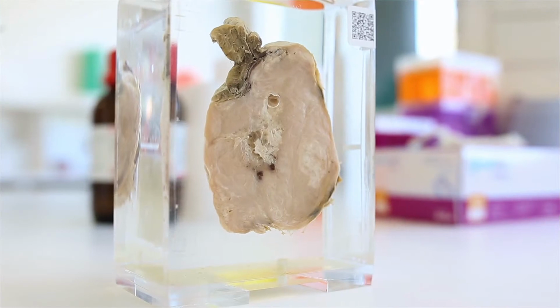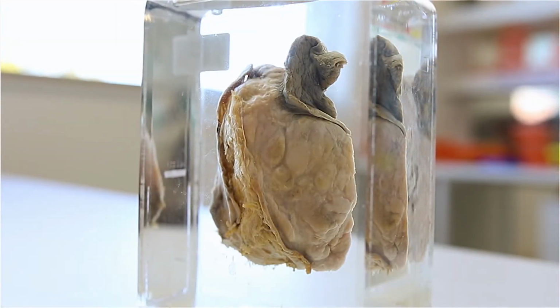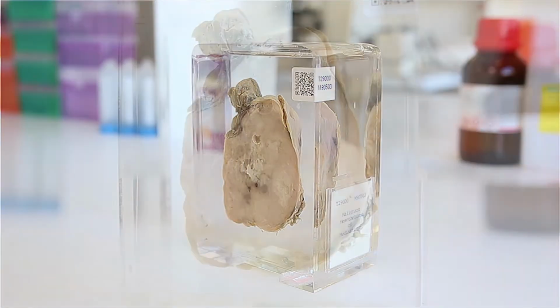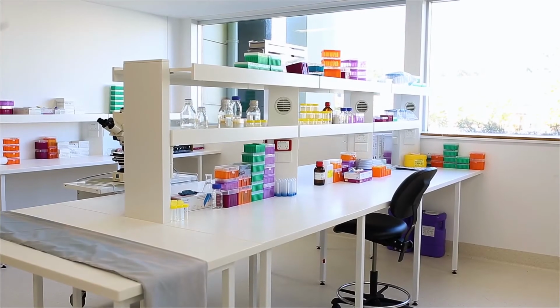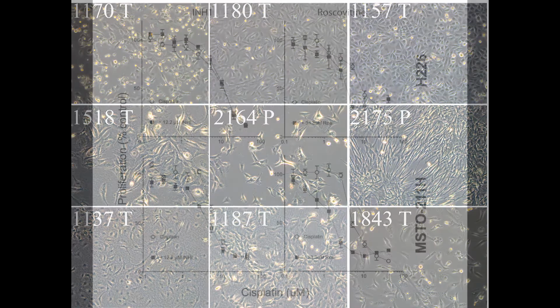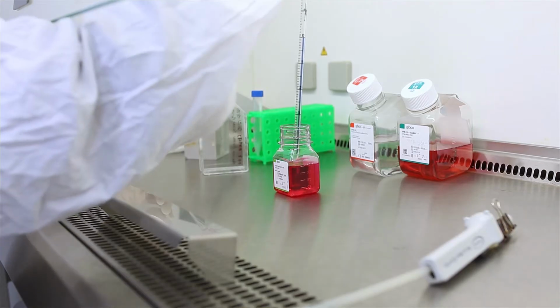Current drug-based therapies for asbestos-related cancers are suboptimal, and drug resistance and toxicity issues limit their clinical efficacy. Therefore, there is a need to develop and test novel drugs in a laboratory setting before they can undergo clinical trials. Drug treatments are routinely carried out on the various asbestos-related cancer cell lines at ADRI. The aim is to elicit a cellular response that will enable us to predict their therapeutic potential for the treatment of asbestos-related cancers.